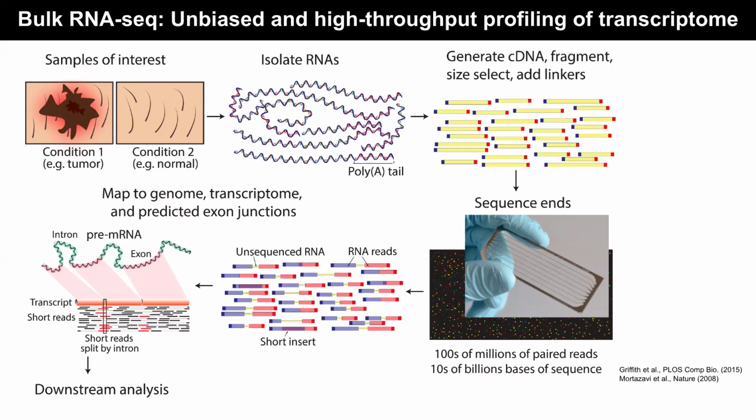So this is RNA. Reverse transcribe it, you get cDNA. Put it on the sequencer, the same stuff that you did previously. Shear them before you do that, and you have your data coming out. Once I get this data, I can map it. It will tell me which gene has how many copies, or how many exons. So now the quantification will happen at the exon level, because all of this data is assumed to be coming from exons. How many exons are there in your sample, or how many copies of each exon are there in the sample? Is the problem clear?